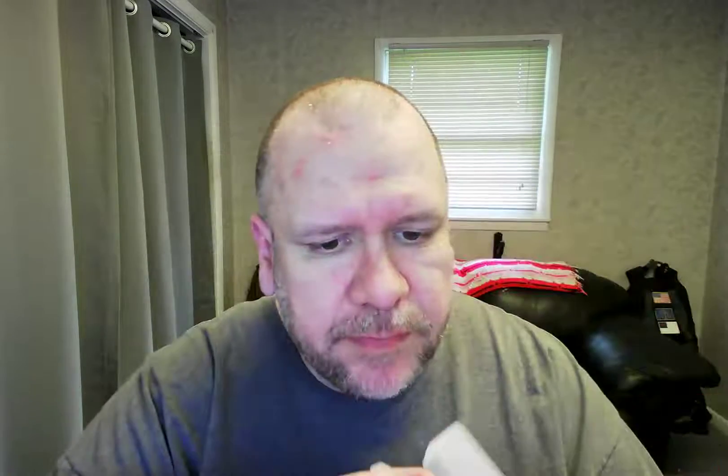When you're done, it goes back to zero when you pull it out. I'm going to dry it off here. So it's good, y'all — my water's not too bad. It's a nice little kit with a nice little case. If you want to really calibrate it well, you've got these little test calibration packets to do that with. I'm not going to mess with that right now.